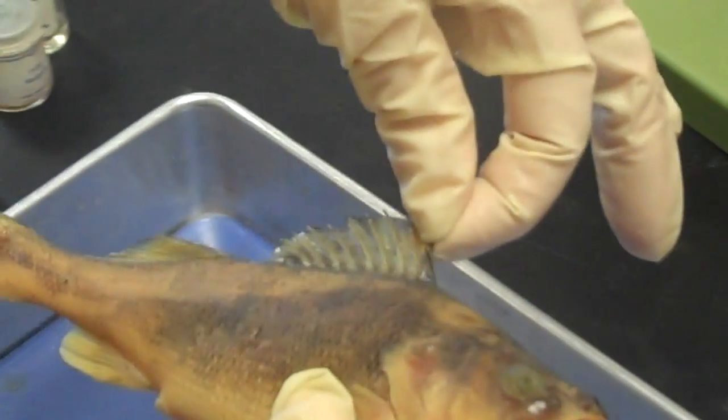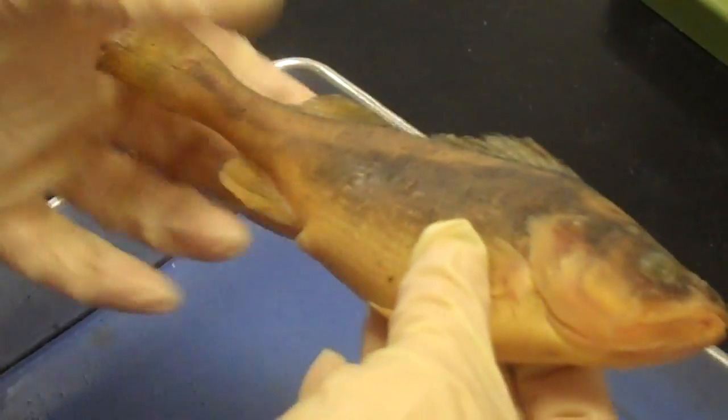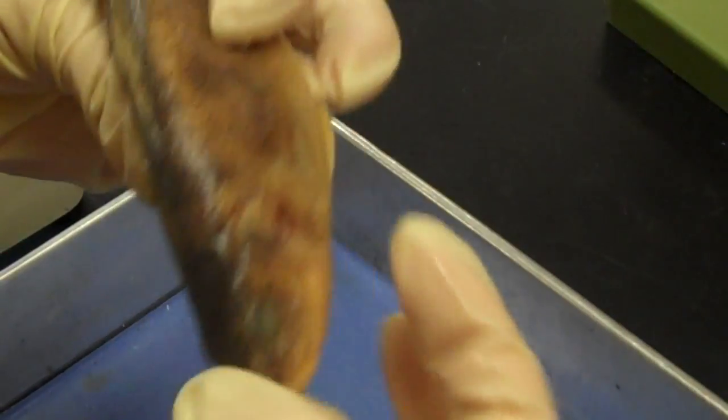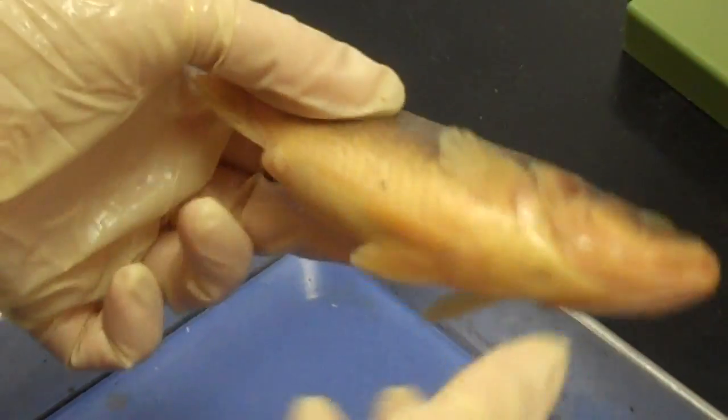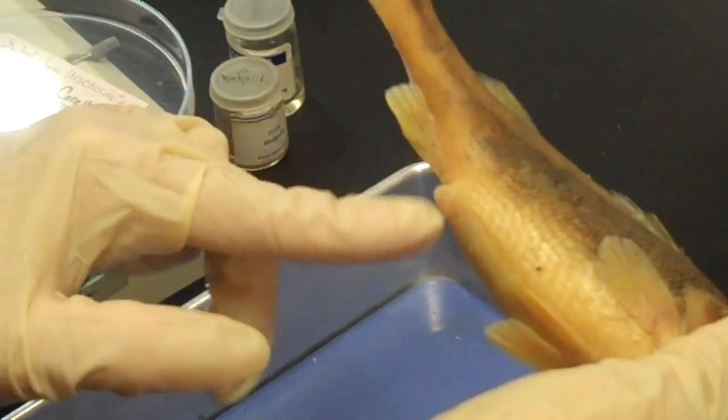The fins. This would be the anterior dorsal fin, posterior dorsal fin, the caudal fin. This here is a pectoral fin — there's one on each side. These are the pelvic fins, and this is the anal fin right by the anus.